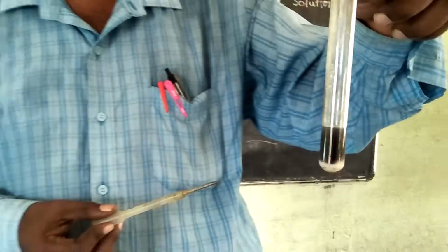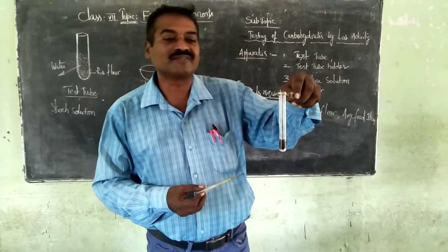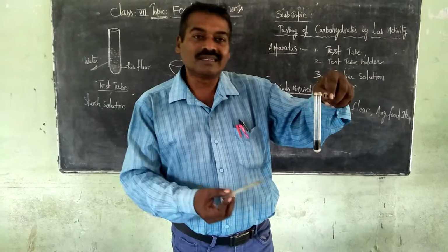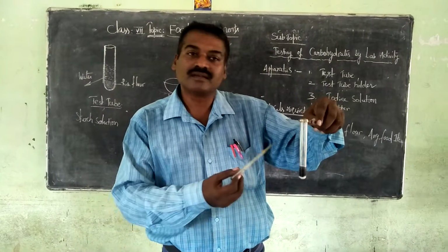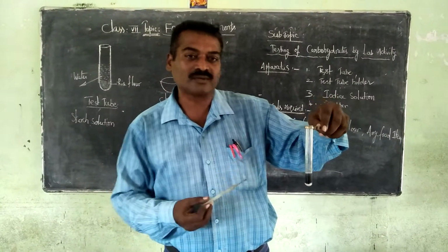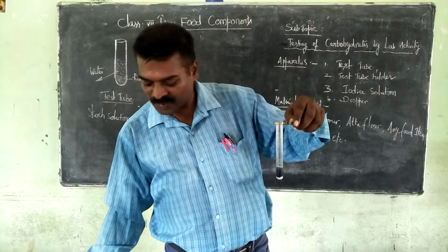In the previous sessions, we explained how to find out carbohydrates from different foods like idli, dosa or any rice, explaining in the classroom. Now we are going to do the same activity by using the laboratory experiment.